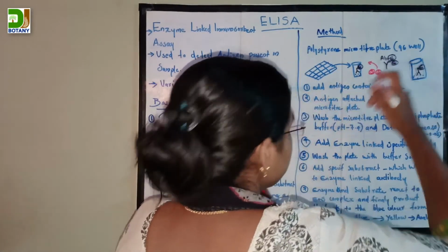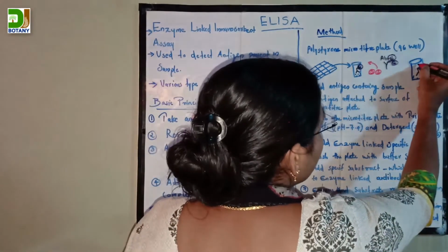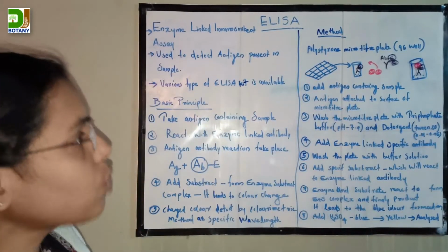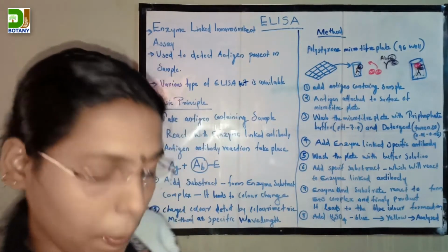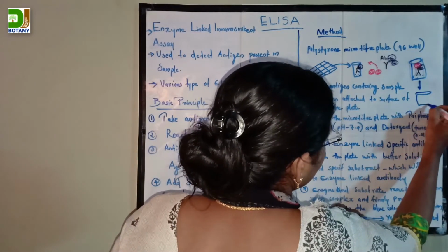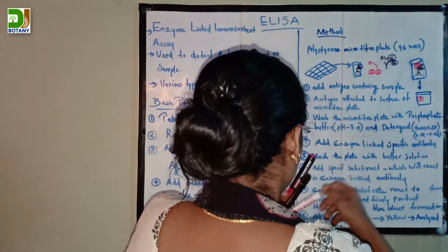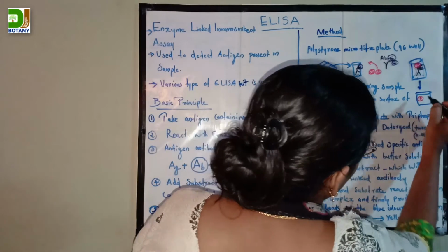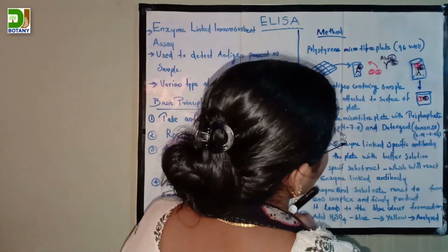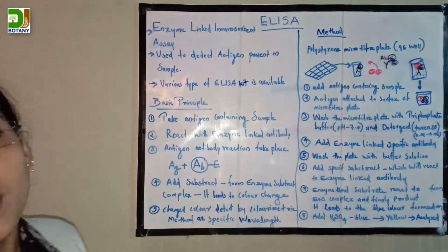This specific substrate reacts with the enzyme and forms an enzyme-substrate complex. Finally, the enzyme-substrate complex is converted to a product.